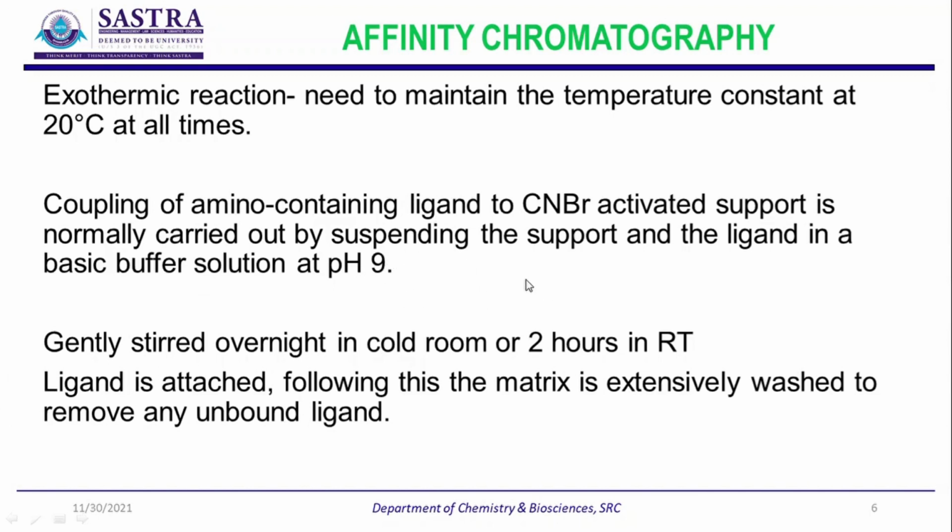It is gently stirred overnight in a cold room or for 2 hours at room temperature. The ligand is attached, and following this the matrix is extensively washed to remove any unbound ligand.